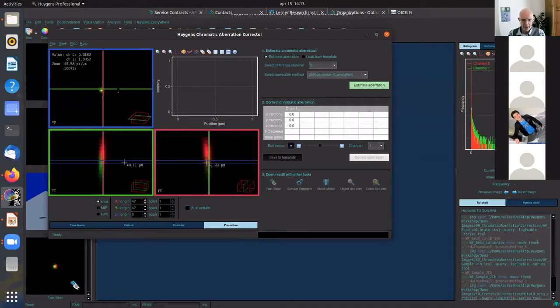And we can play a bit around with these selections of the area. This is an orthogonal slicer, and you can watch if I move with this positioner, I can slice through the bead. And I can do that in the different views. So the green slicer shows you the green window, and the red slicer shows you the red, and the blue shows you the blue window.